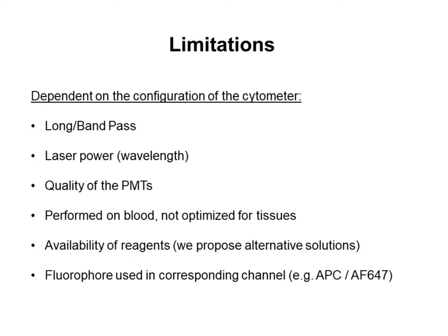The availability of reagents is a limitation, but this is one of the advantages of the core panel we designed: we leave the empty channels for reagents that are easily found from many of the antibody providers.